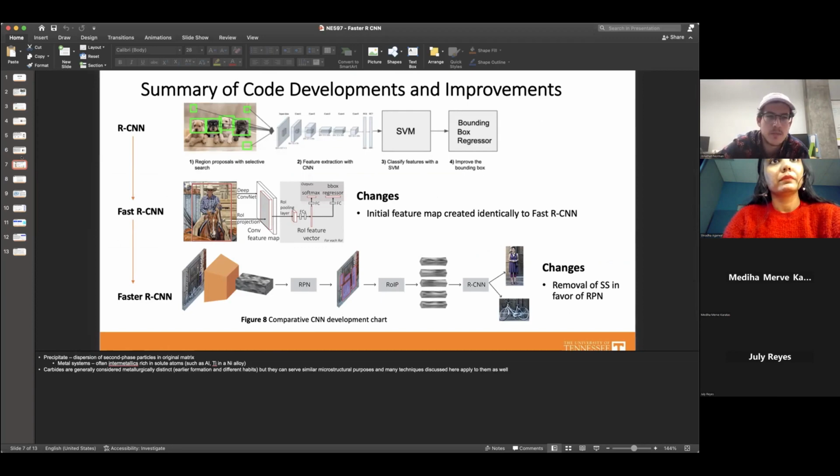But basically, the difference was in RCNN, you have the two neural networks. In fast RCNN, it turns into one neural network where first the image is broken down into a feature map, isolating what all these features are. And then it goes into the next step where, from the feature map, you're applying a classification and bounding box scheme. So it's two steps, and that's why it's all operating in a linear manner here.